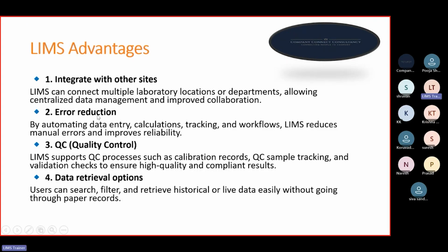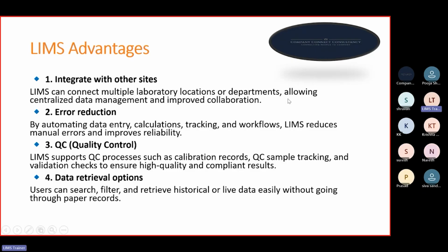Integrate with other sites. Okay, so LIMS can connect multiple laboratory locations or departments, allowing centralized data management and improved collaboration. Okay, so like if any MNC pharmaceutical company is there, and that company has the head office in Mumbai, let's suppose Mumbai, and multiple sites in different countries or different locations. Okay, so now they decided to implement software into their organization. So what will companies do?